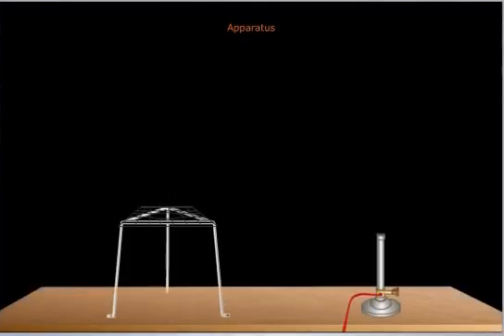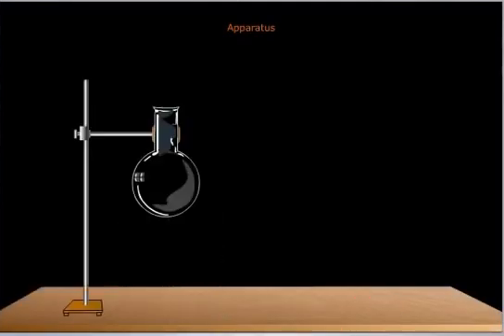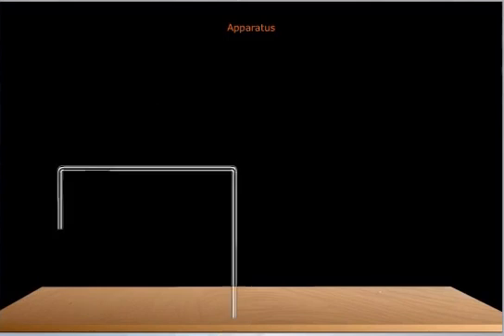Apparatus required: Tripod stand, burner, round-bottom flask fixed to a clamp, thistle funnel, delivery tubes and gas jar.